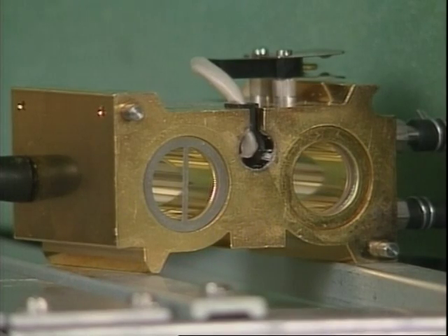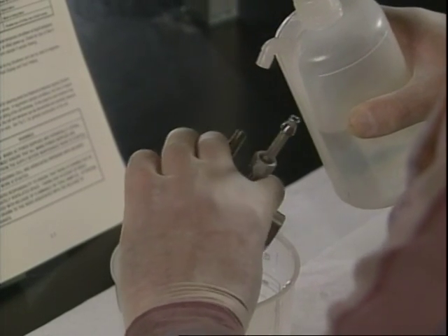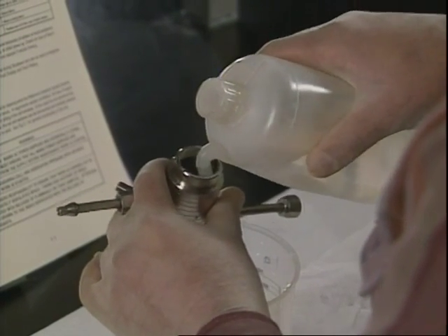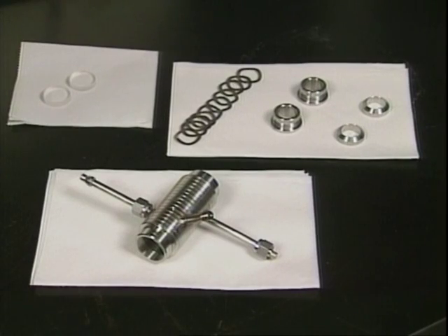Some sample cells have highly polished or gold-plated inner surfaces that should be cleaned as recommended by the manufacturer. Rinse or flush the cell with distilled or deionized water to remove any residual cleaning solution and set the parts aside to dry. The reassembly process is the reverse of the dismantling process, with some exceptions.